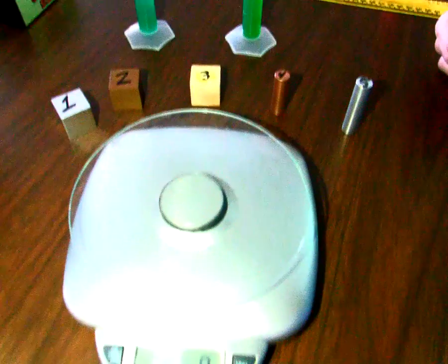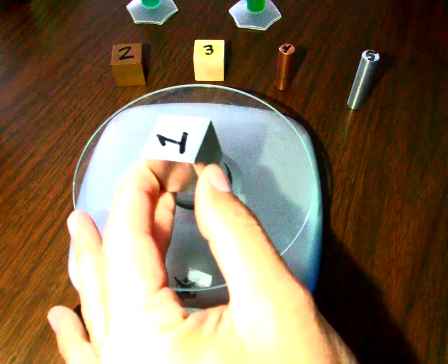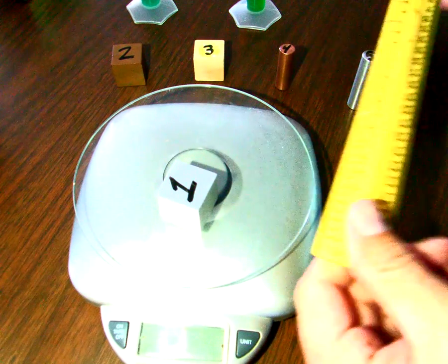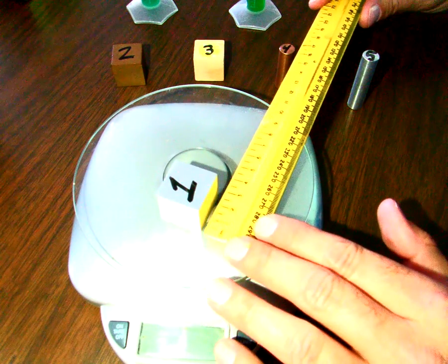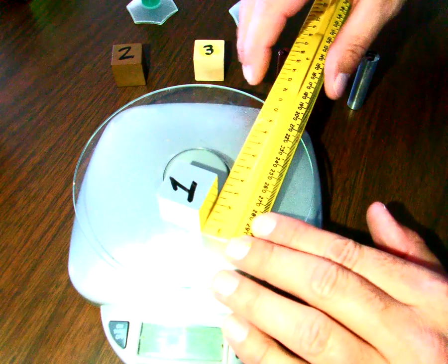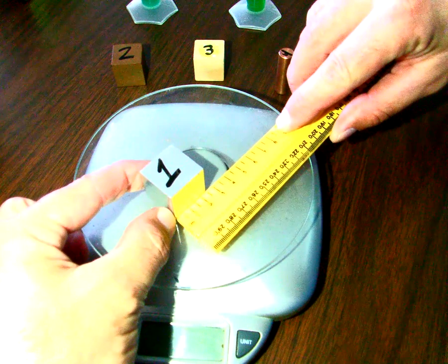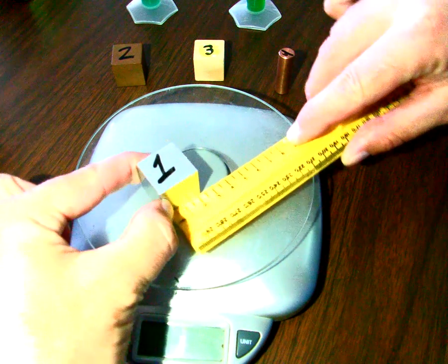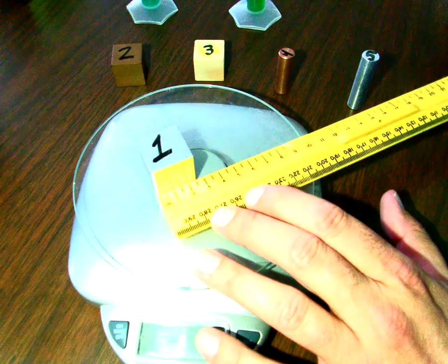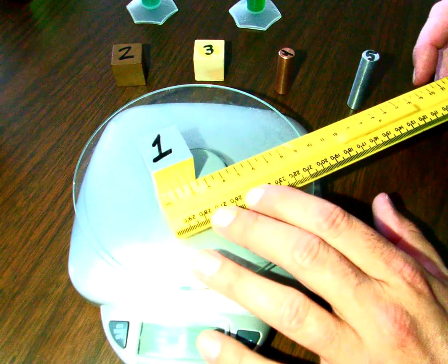I'm going to move this down a little bit. Block number 1, you can see when I measure it, it is a cube. It's a perfect cube, and on one side the length goes to right there. So I'm going to move this a little bit for you. You can see that a little bit better. So here is one side of our cube. Okay, so that should help you figure out your volume.